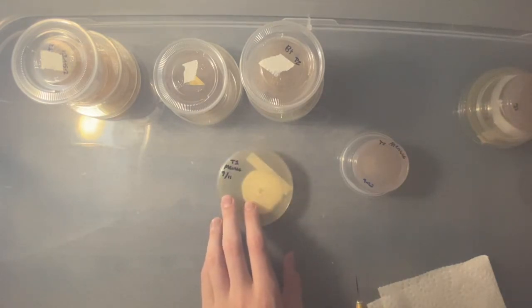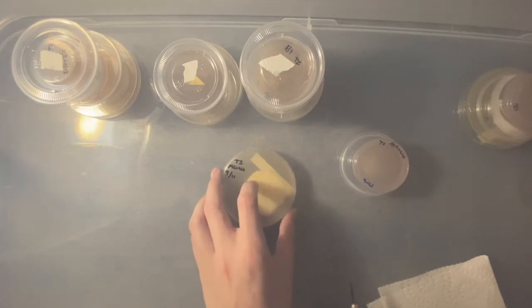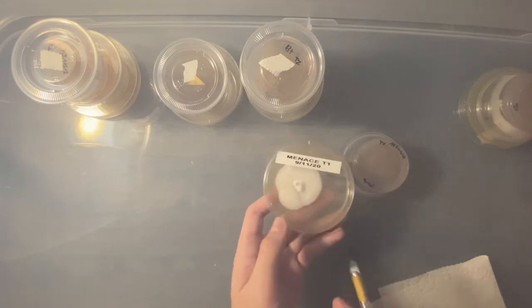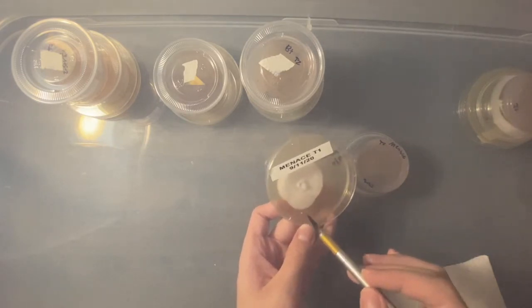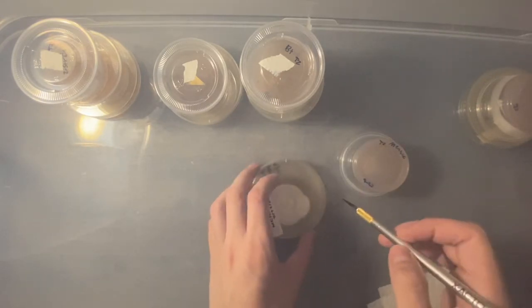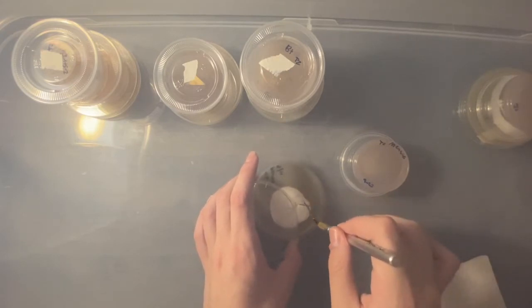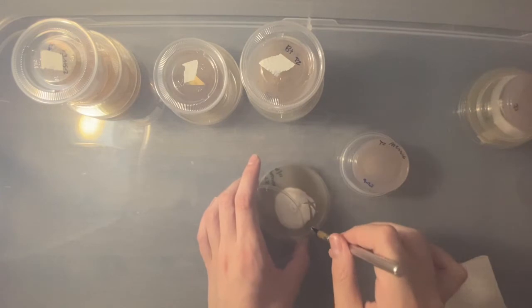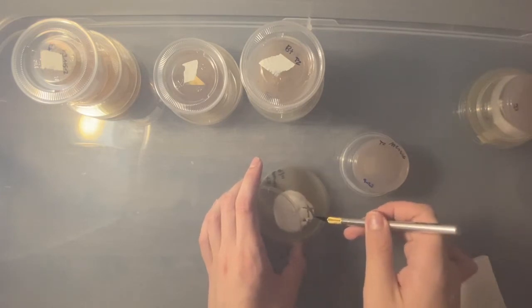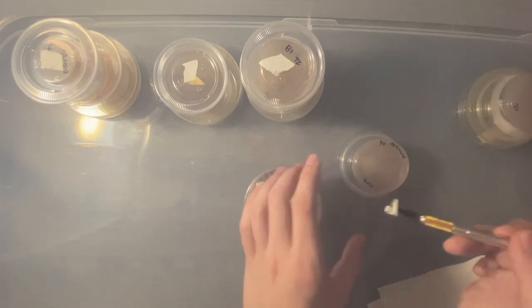And in between each variety, I'm flame sterilizing the knife again, just to make sure I don't transfer any genetics from anything else. So I'm gonna take this piece right here. It's a lot thicker, more uniform. Oh, that's too small. Okay. Damn, it is just ripping this mycelium up. Hate it. I probably need to get a new blade, even though this one's brand new.